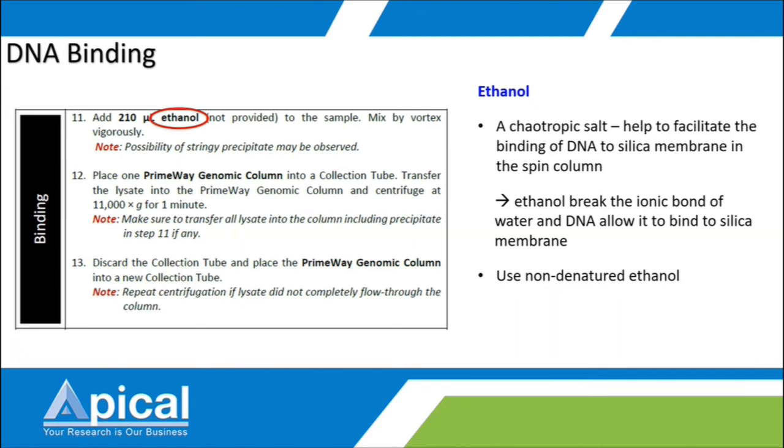And some of you may ask me, there are many grades of ethanol, so which one is better? Do look for biotech grade or molecular grade ethanol, then it is good to be used. Okay.